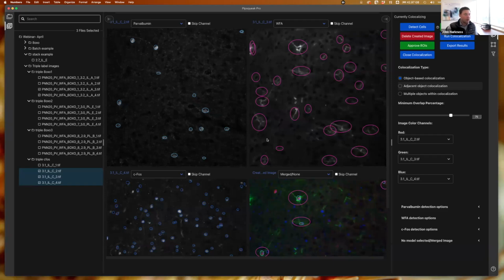So before I move on to the last thing I want to cover, just any questions on co-localization, on batch processing, on single label analysis? Hopefully this is looking pretty familiar to you. Again, these are tools that we've based off of some of the workflows that you've done in ImageJ. So, we want this to be fairly intuitive and pretty straightforward.